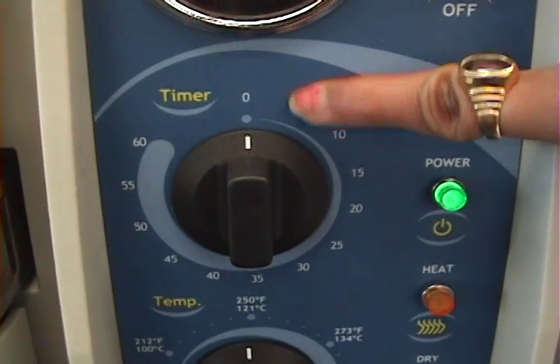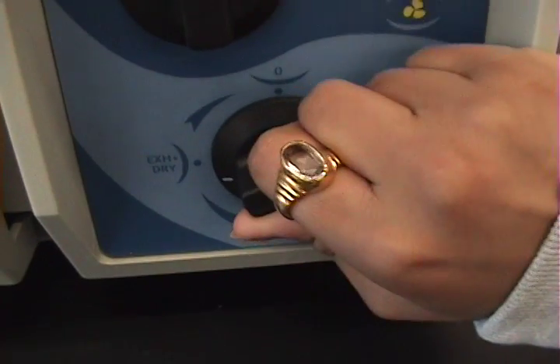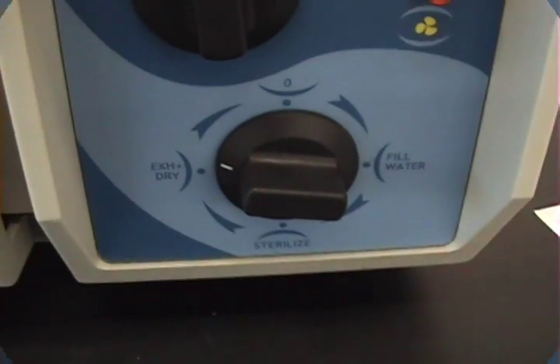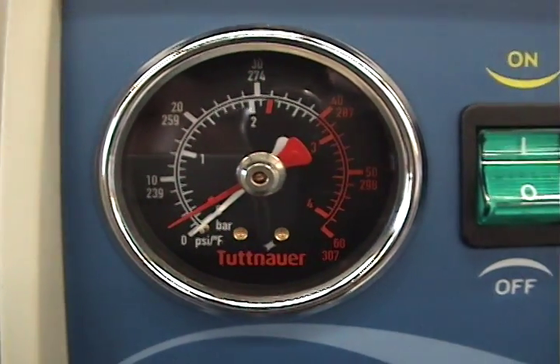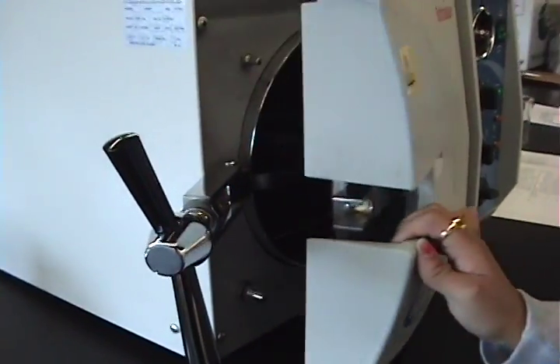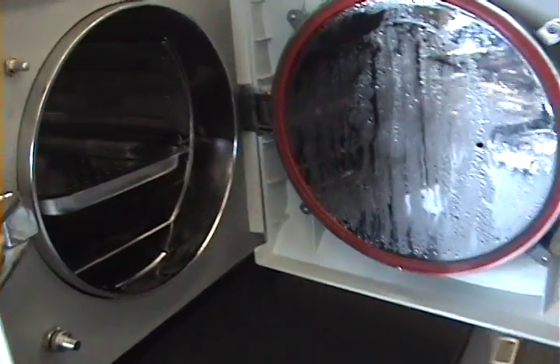21 minutes later, the timer has reached zero. Turn the last knob to exhaust dry. Make sure the pressure gauge shows that the white line is at zero. Open your autoclave, and if it is not dry, redo the exhaust dry — you have done something incorrectly.